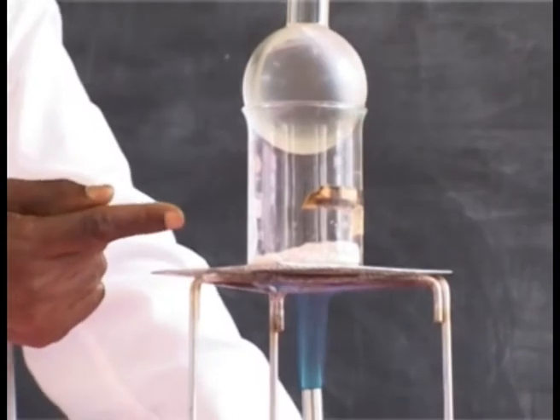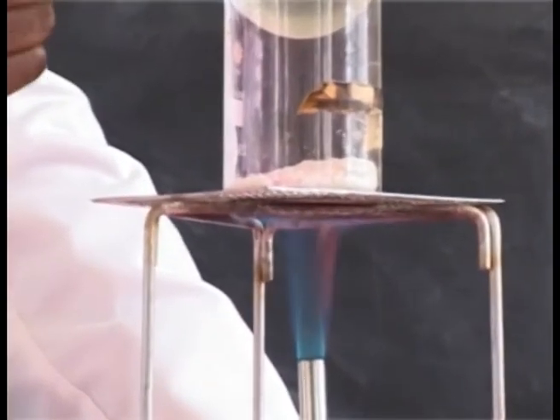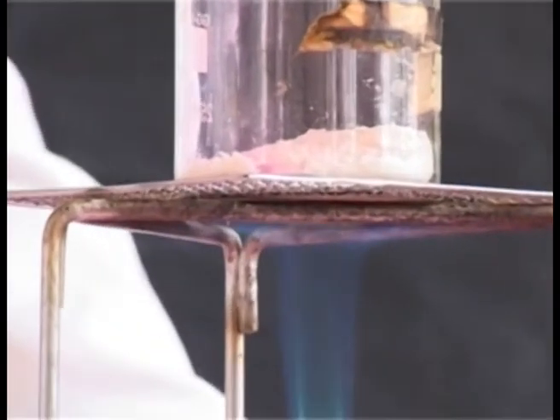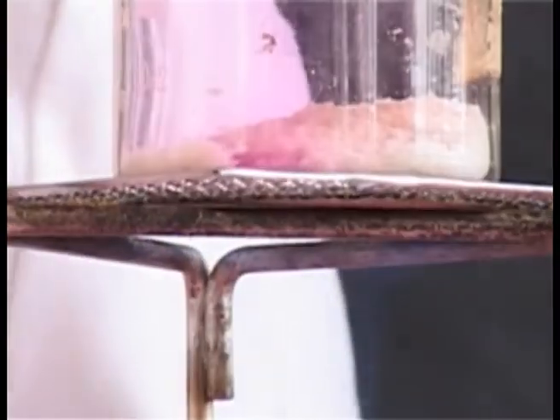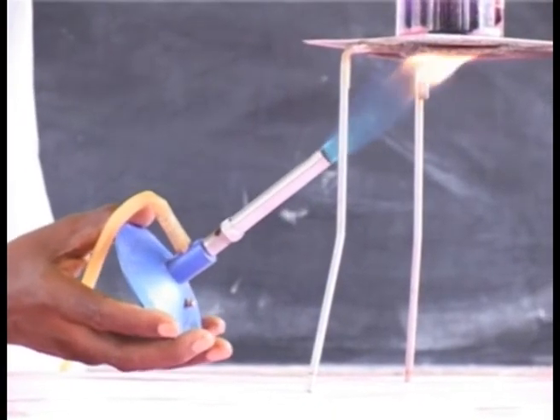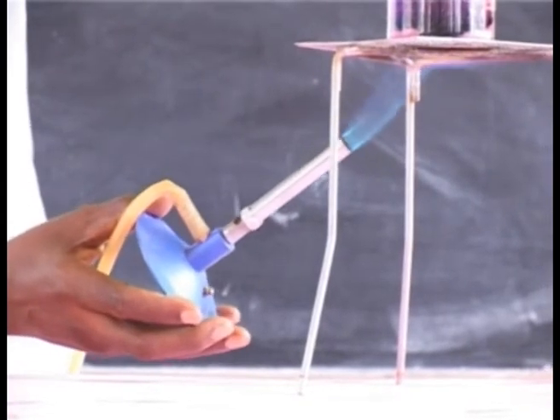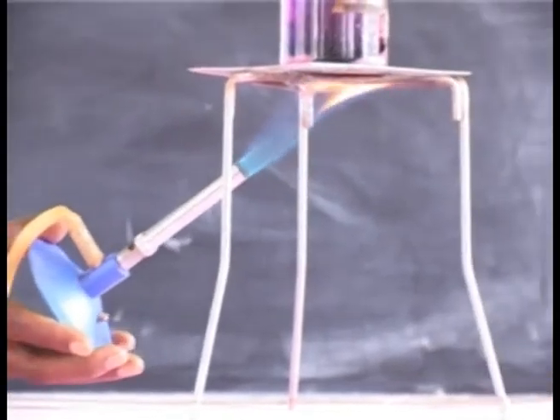The solid here will change to vapor, and then on the cool surface, crystals will form, which are solids. In this experiment, you have to be careful not to inhale too much of iodine vapors.